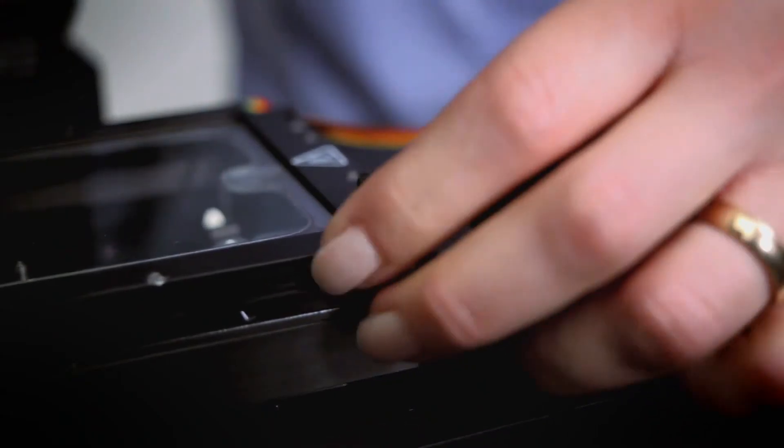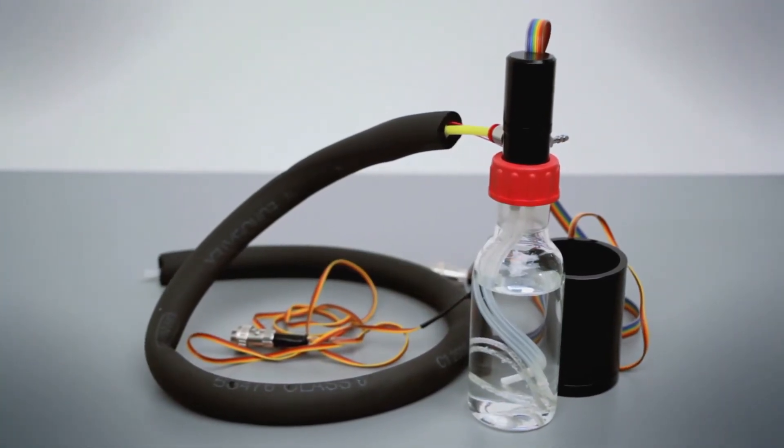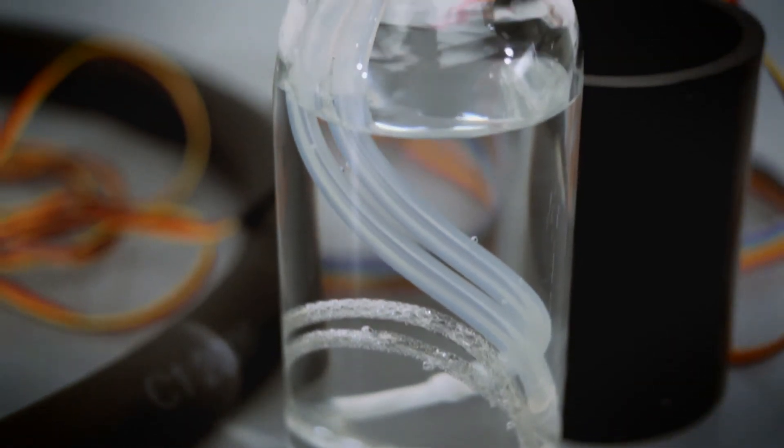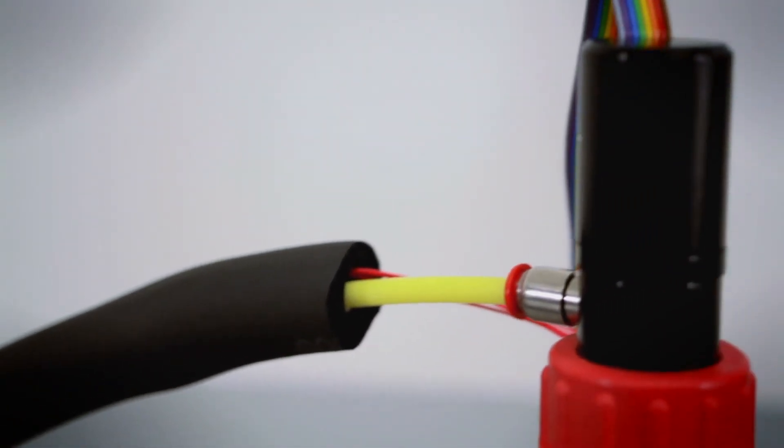Before entering into the chamber, the gas is humidified by the active humidity module which employs a water permeable membrane, a humidity sensor and a heated tube to ensure the desired relative humidity inside the chamber.